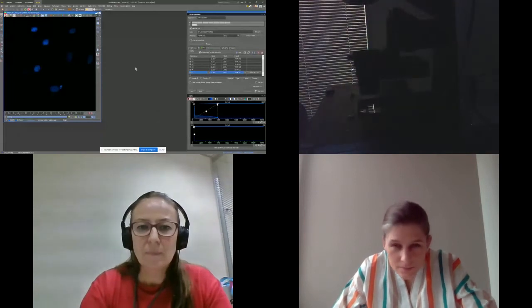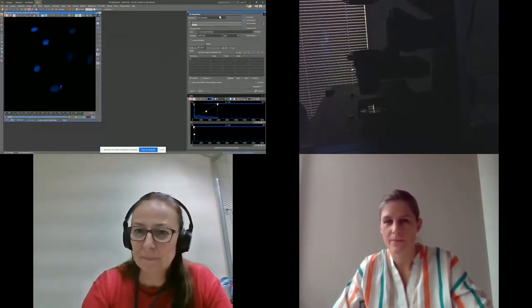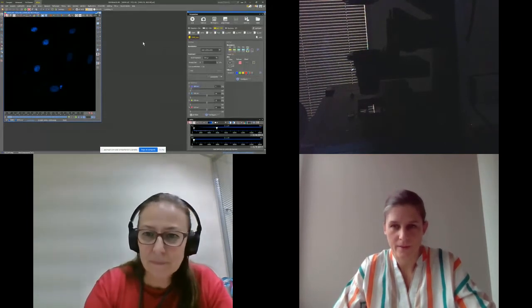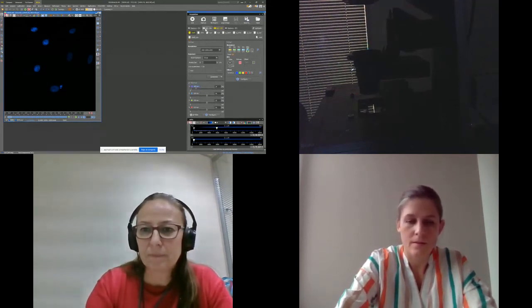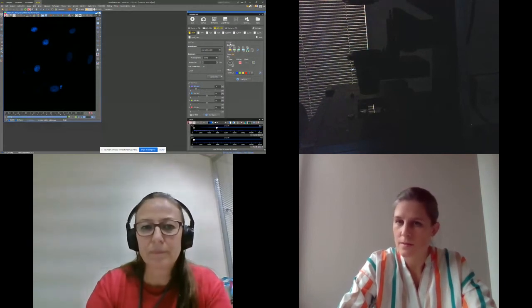Well, anyway, let's start. So that's what I've prepared. I'm going to show first the sample we have. It is a very simple sample, one of those samples that we use for demonstrations. So here we have our microscope. This is the acquisition controls we have. And in our sample, we have the three typical colors that can be found on those molecular probe samples.